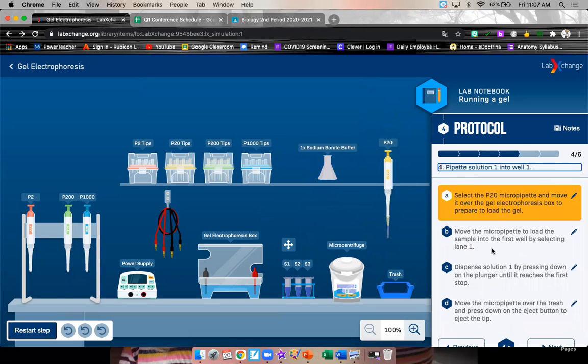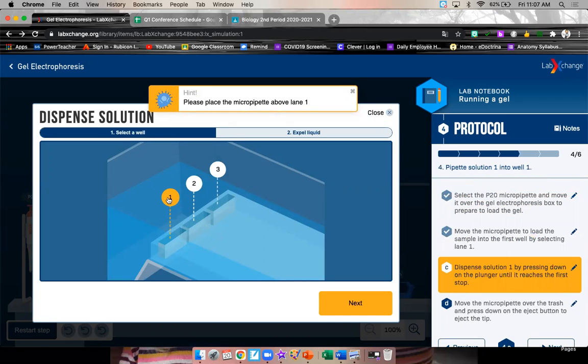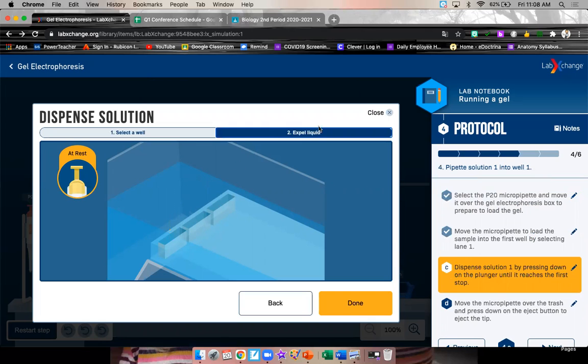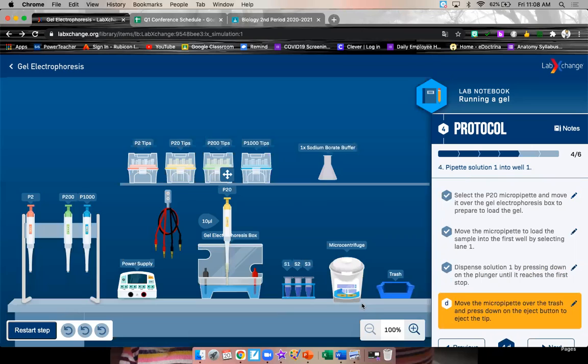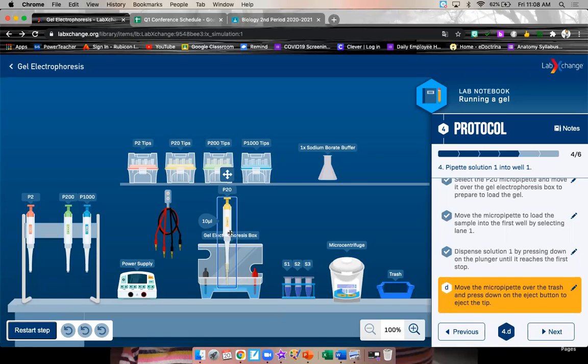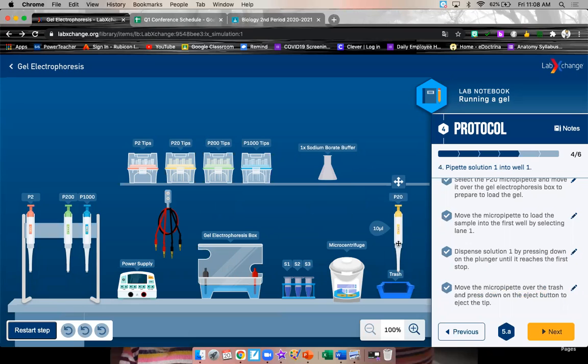Next, take your P20 pipette and move it over to the gel. Pick the well you want. We said S1 is going in well one. Then expel liquid. Again, only press for the first stop. If you hold it in too long, then you'll overflow it. Cool. Done. Move the pipette over to the trash. Eject tip. You don't want to reuse that.